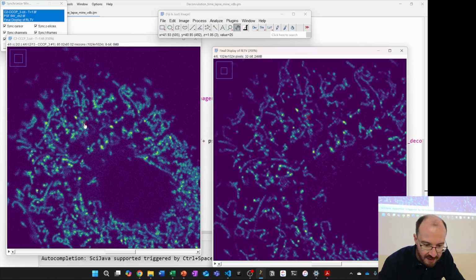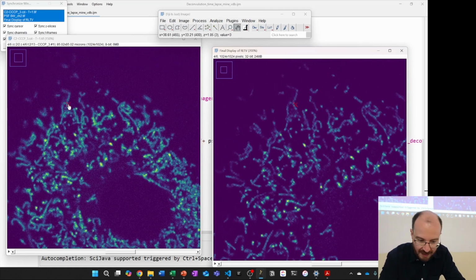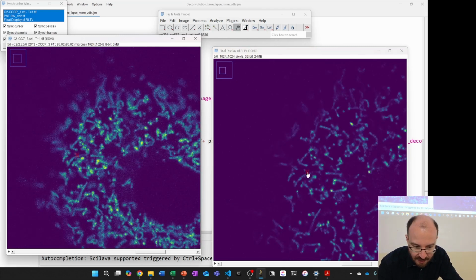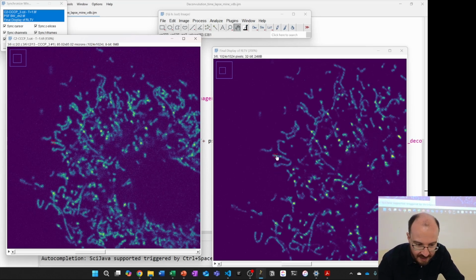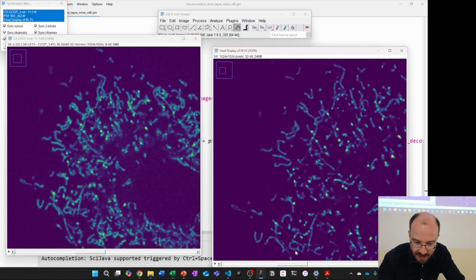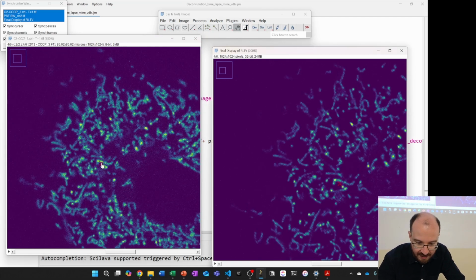Yeah. Because previously, what we were looking at here is not the intensity on a single Z plane. It's actually some of the intensities from the lower planes bleeding through. And if I now scroll through this, you can see that, let's say, for example, this structure there, here I can see some intensity, but that's actually a lower Z level, which the intensity is bleeding through. And if I was to just scroll through it, I will find there's the structure. That is actually where it's supposed to be. So I've got everything, especially in Z now, very nicely in the place where it's supposed to be. And in X, Y, everything is just sharper.